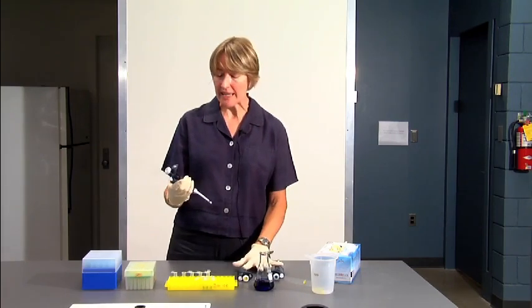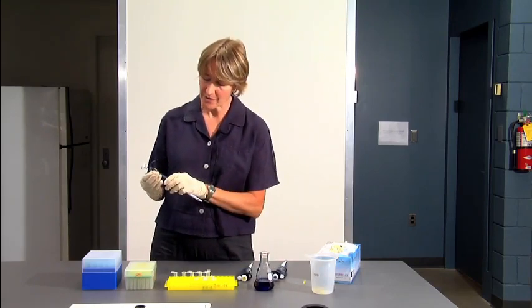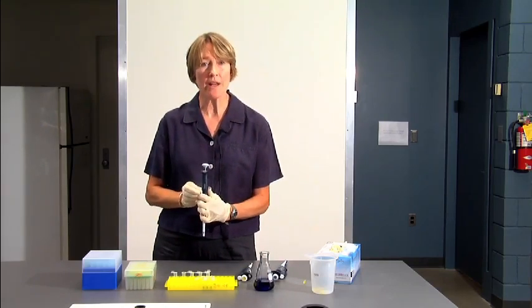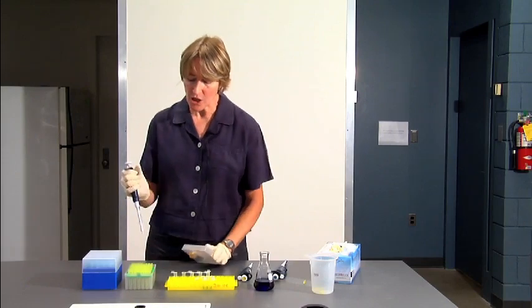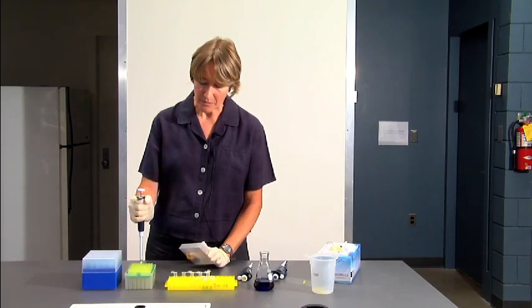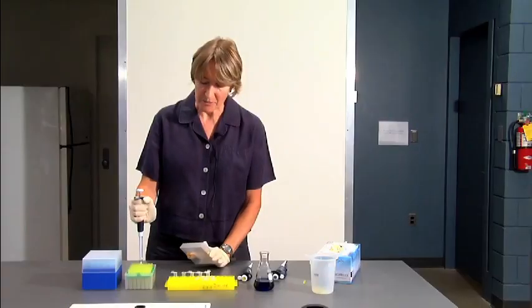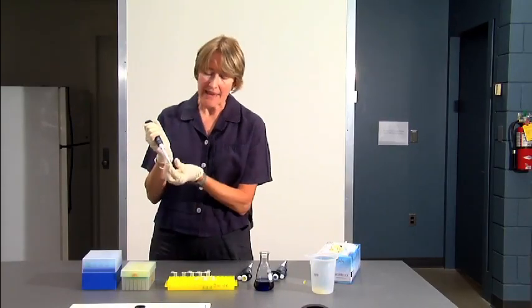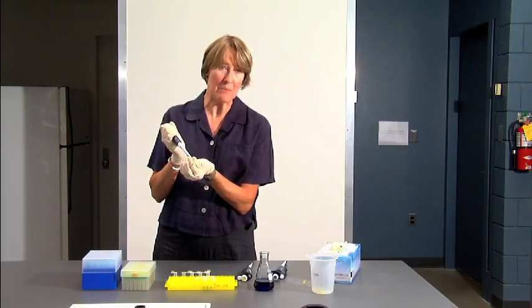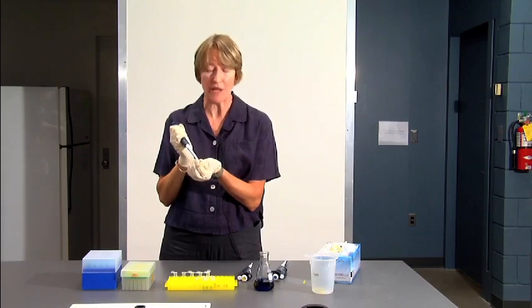I'm going to use the P200, and we're going to pipette 100 microliters. So I've set this to 100 microliters, 100, and I'm going to put a yellow tip on the micropipette. Press the micropipette down onto the tip. You don't even have to touch the tip. Lift it out of the box, and then you just might want to make sure that the tip is tight. You want it to be tight, because if it's loose, you might pull up bubbles or the tip might fall off.